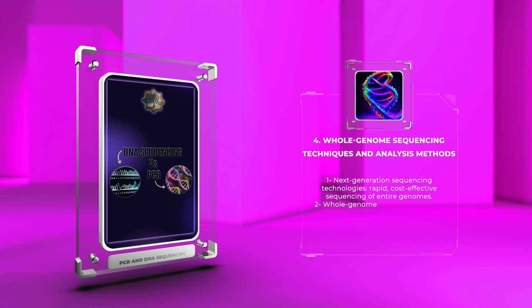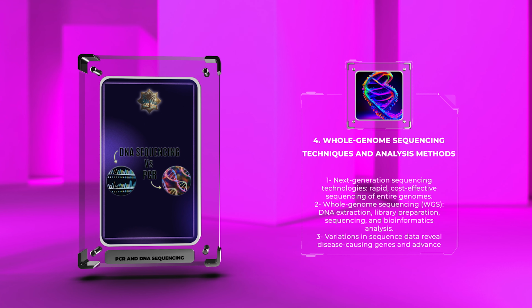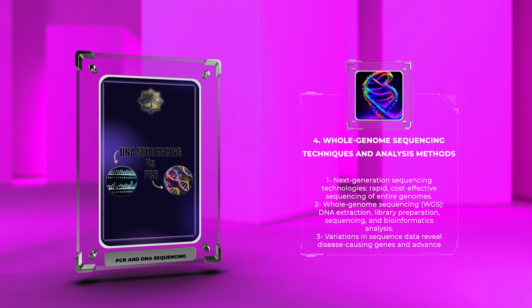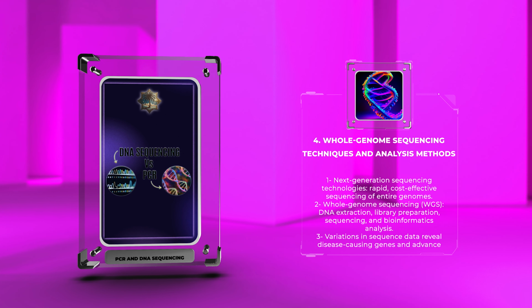Next-generation sequencing technologies have transformed genomics by allowing rapid, cost-effective sequencing of entire genomes. Whole genome sequencing, WGS, involves DNA extraction, library preparation, sequencing, and bioinformatics analysis. Variations in the sequence data help reveal disease-causing genes and advance personalized medicine and evolutionary biology.